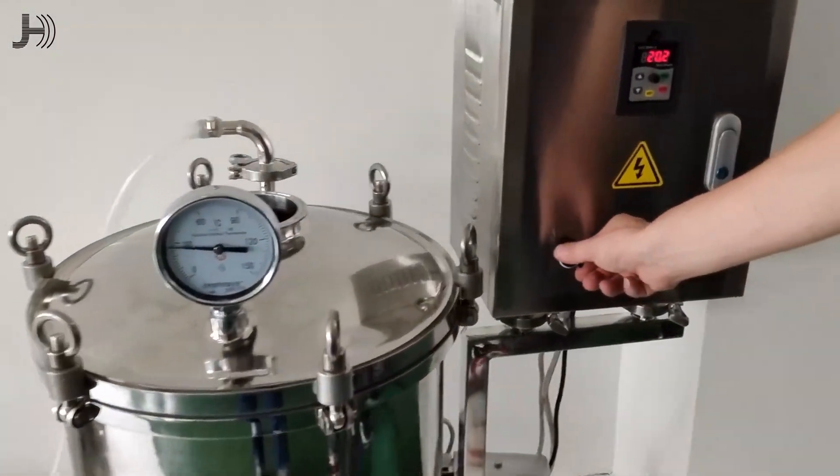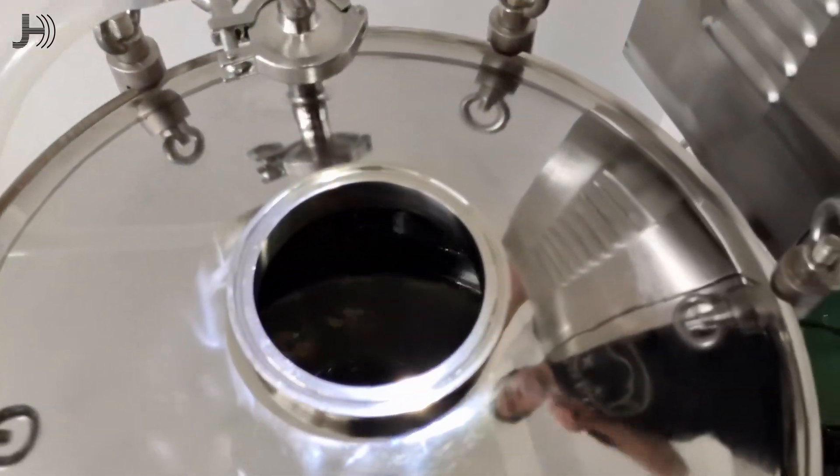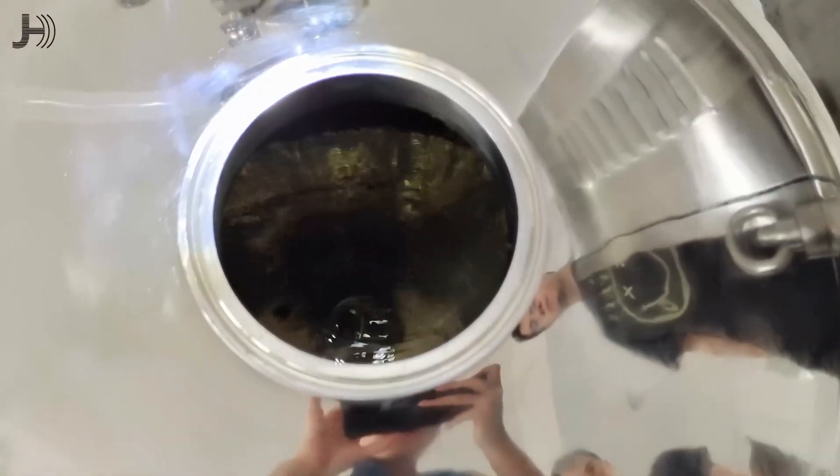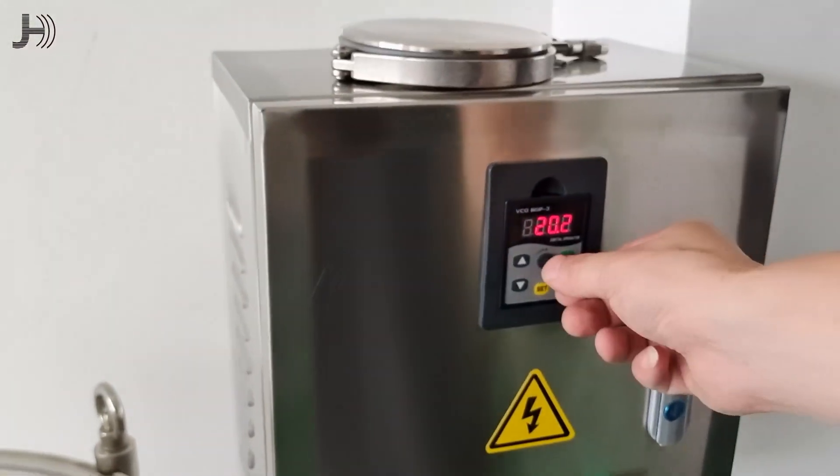First, let's turn on the magnetic mixer. You can see it works and the speed can be set here.